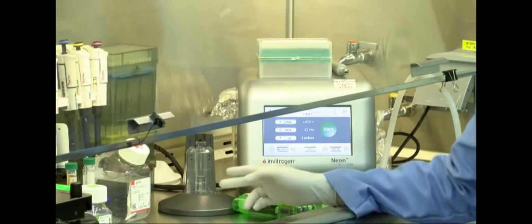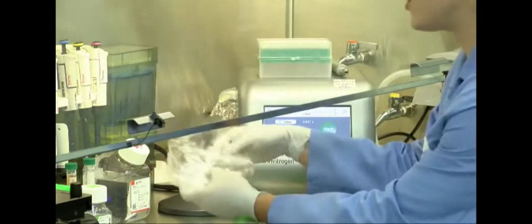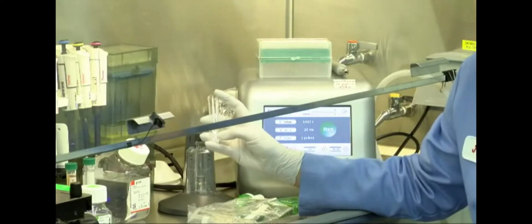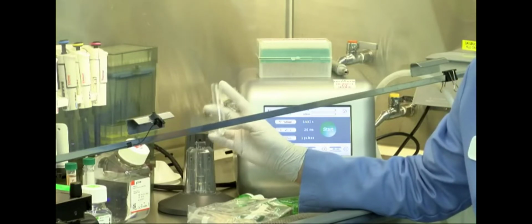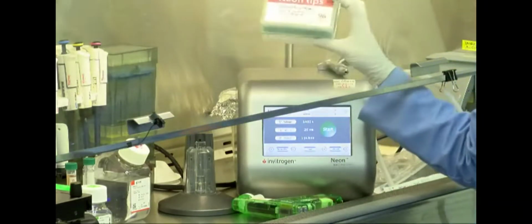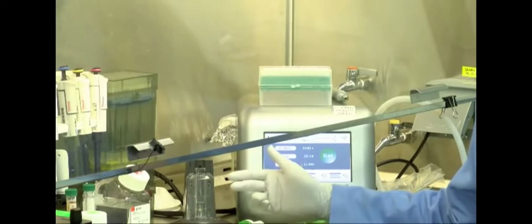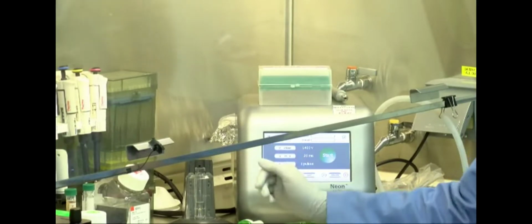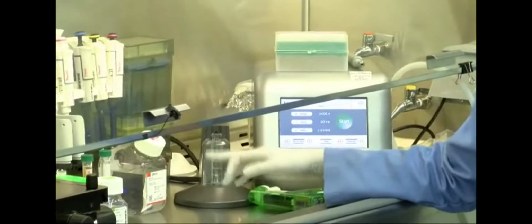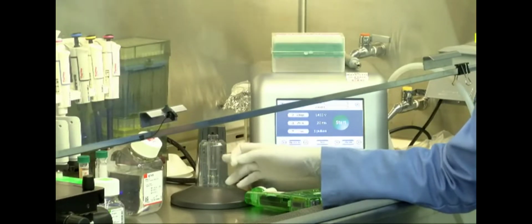The second piece is the Neon pipette station, and this holds the Neon tubes. These tubes come in the Neon kit, and they have an electrode at the bottom, which transfers the electric field from the electrode in the Neon tips. The Neon tips come in 100 microliter and 10 microliter sizes, and for the training today, I'm going to be using the 10 microliter tips. I've also already loaded my Neon tube into the Neon pipette station, and I have added 3 mL of Buffer E, which also comes in the Neon kit, into the tube.